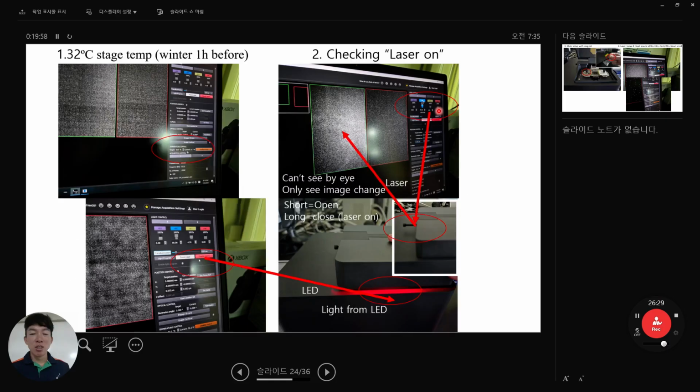So people ask me, after STORM dye, can you visualize by confocal? Yes. After your sample, you first check by confocal, whether they are staining properly or not. But you use non-oil immersion, just water immersion solution for imaging. And after you visualize by confocal and capture, you wash it, and then you can put STORM imaging buffer later. This is the image I can get from confocal. This is the image I can get from STORM imaging.